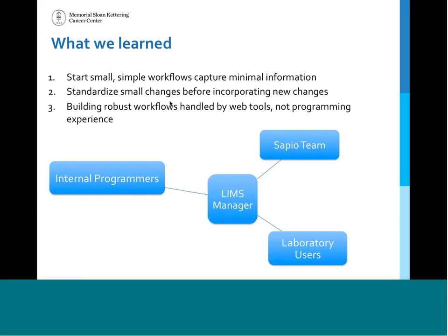So to sum up, what we learned while integrating the LIMS system is it's best to start small with simple workflows to capture minimal information. And then it's really important to standardize small changes before incorporating new changes. When you live in a constant state of change, it's important that people feel comfortable with the change that's already occurred before you put a new change on top of it.